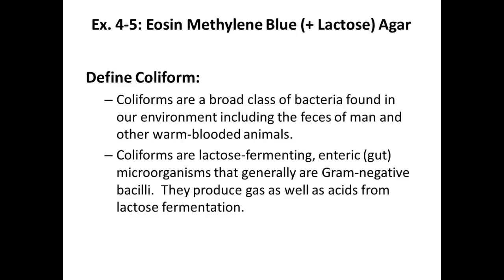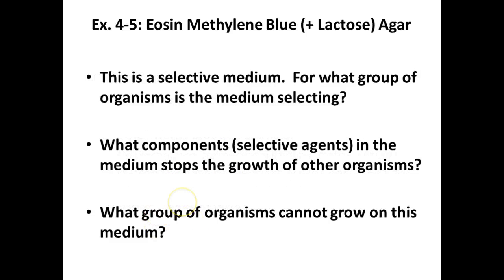And they produce gas, but again, we're dealing with a plate and no Durham tube, so are we going to see gas? No, right? We're not going to be able to detect gas. But they are going to produce acids from the fermentation of lactose. And when they do that, they interact with the dyes in this media, and they create distinctive color changes. And I have to say, this is one of my favorite ones because E. coli is just absolutely beautiful on this plate.